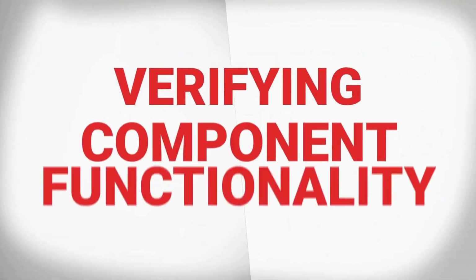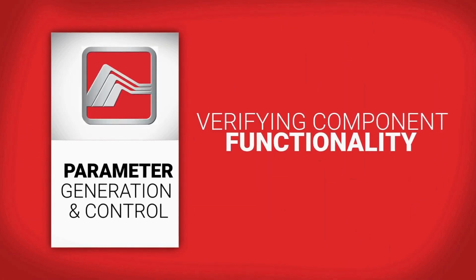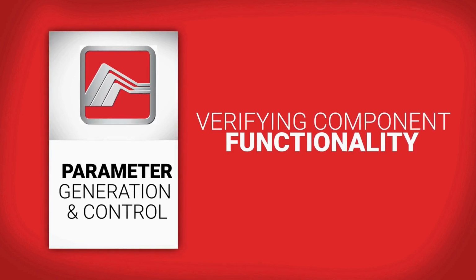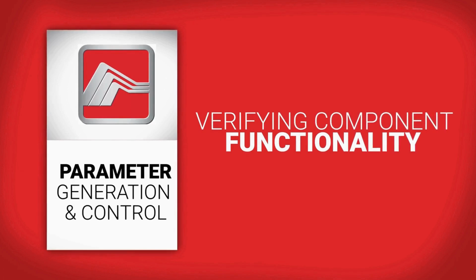State the use of the chamber, long-term or short-term study, QC tests or laboratory. Document the tolerance and time limit allowed out of condition and be sure that the customer approves of the same. If the customer indicates any past or current problems with the chamber, record those notes.